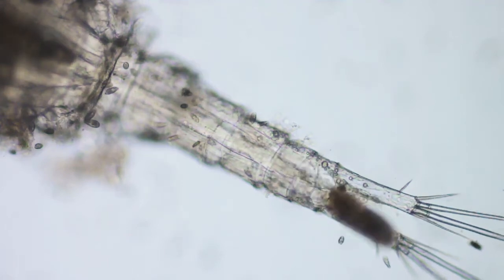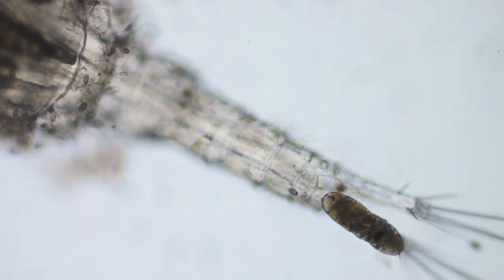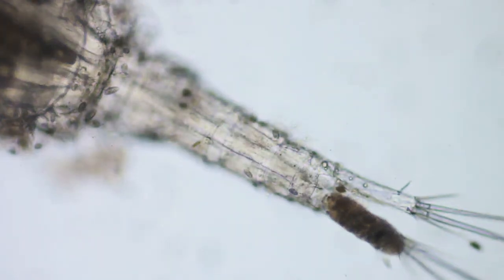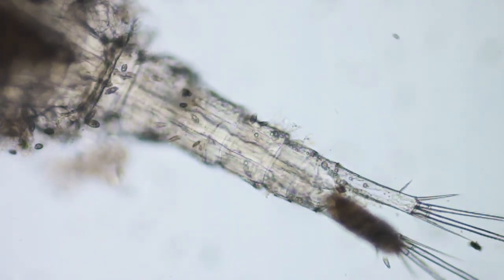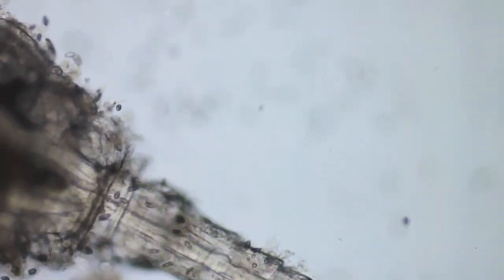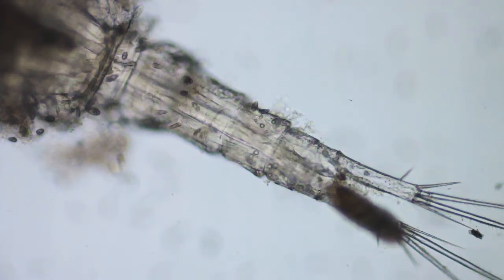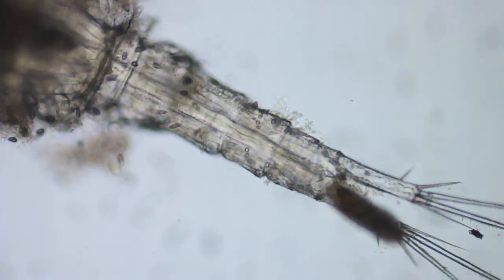There it goes. Great. This is the actual first time I've seen where the actual opening is. I've seen the turds further up the column there, but never where they could actually come out. So that's pretty interesting.